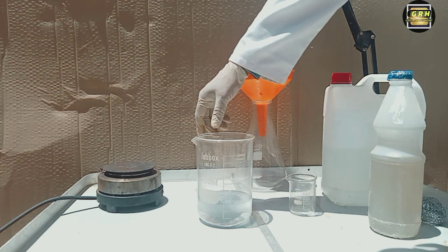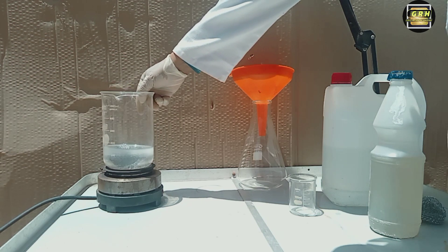This operation should be done outside, in a well-ventilated area, or under a good fume hood. Wear rubber gloves and eye protection.